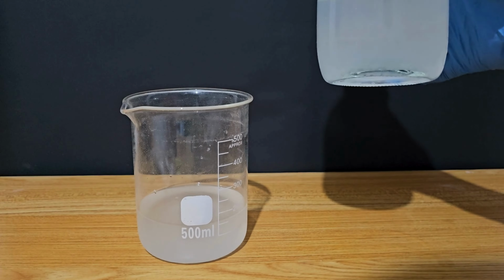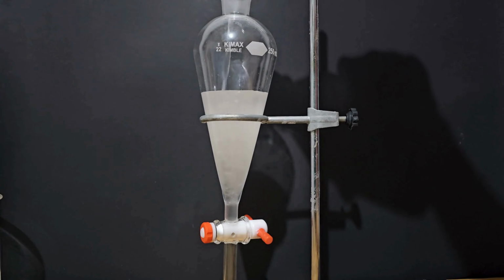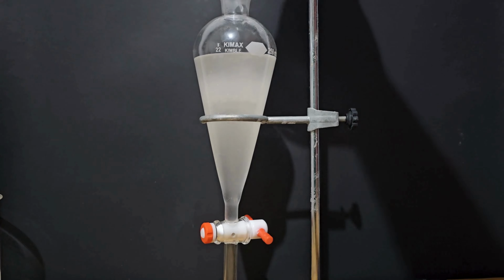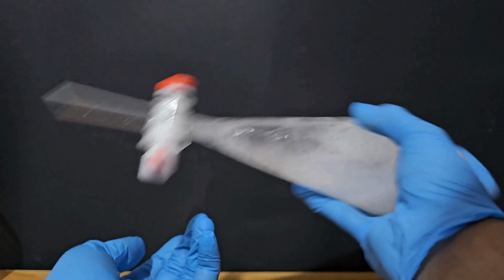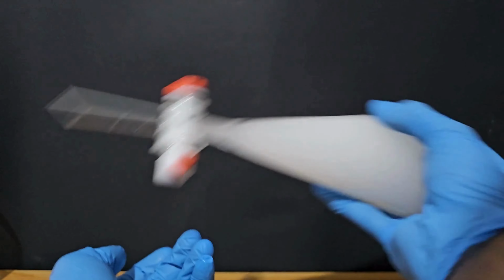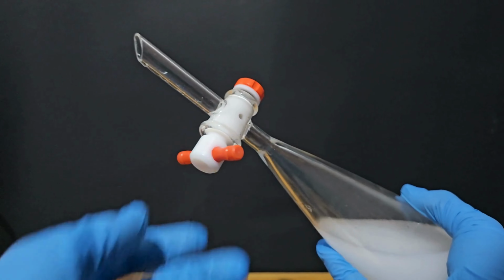I decanted most of the water layer and transferred everything into a separatory funnel. I separated the chloroform and in total made 2 washings with saturated sodium chloride solution and 1 with distilled water.